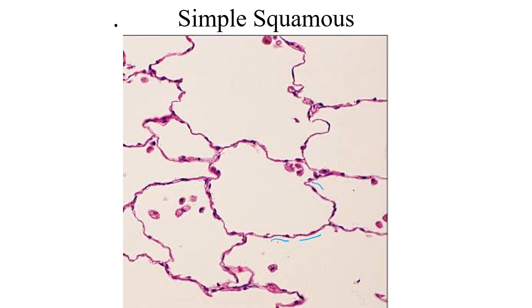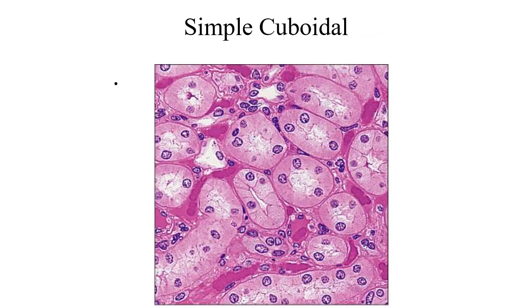This is a sample from a lung. These are the alveoli inside the lung, and we can see the individual simple squamous cells that we find inside there. The basement membrane tells us that that's the beginning of the tissue, and we then have one single cell, and then we come to emptiness. Remember that for epithelium, it always ends in nothingness. There's always a border where we end up going out into an empty space rather than having tissue right next to it. And so we see that there.